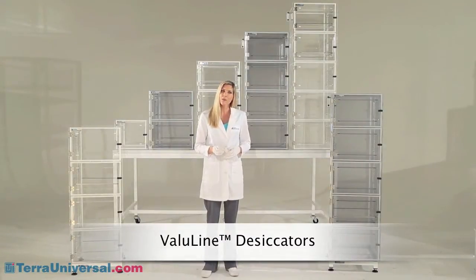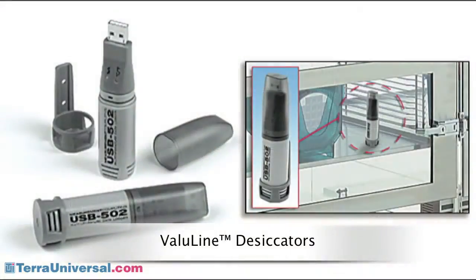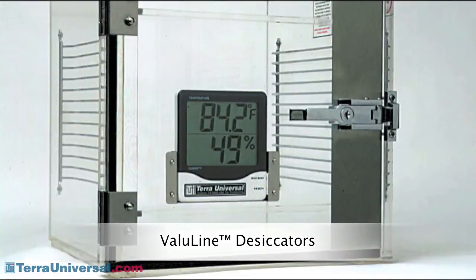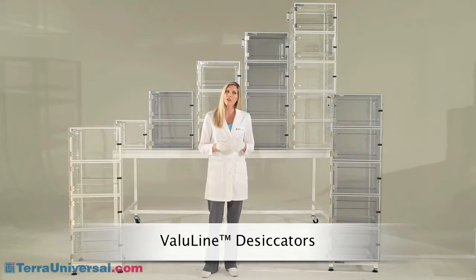Terra offers a couple of humidity monitoring options for use with this and other desiccators. The RH temperature data logger records both RH and temperature at selected intervals over a selected time period from a few days up to months. To view data, you simply remove it and plug it into a USB port on your computer. You can also add an NRH temperature monitor which mounts inside the cabinet to provide a real-time display of environmental conditions. Refer to Terra's library of videos for more information on automated gas control systems available for other Terra desiccators.